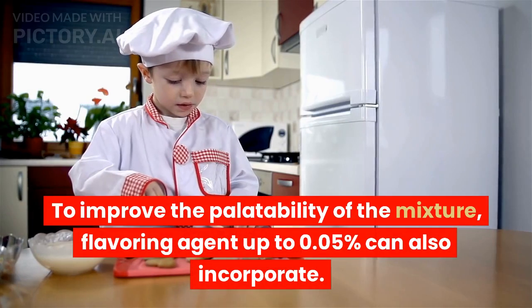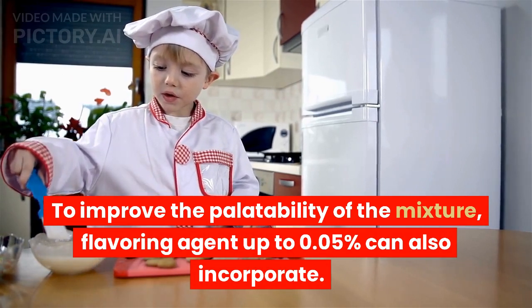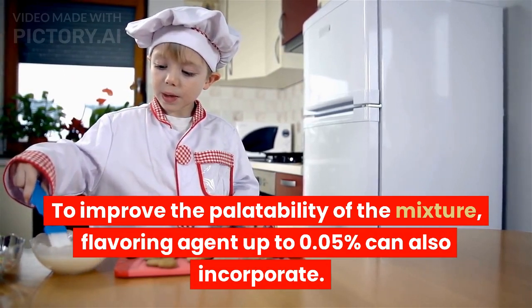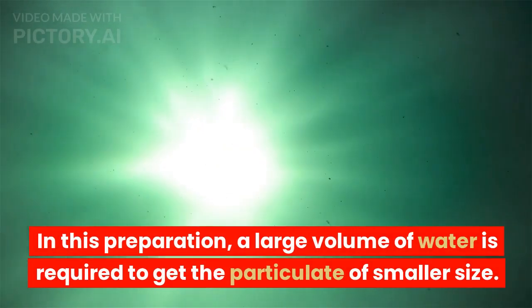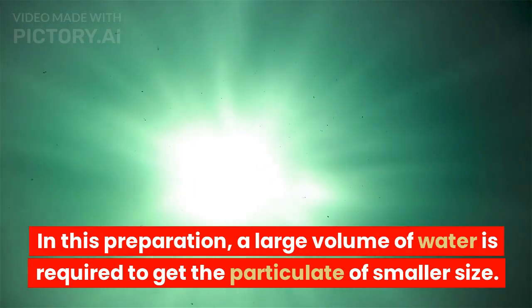To improve the palatability of the mixture, a flavoring agent up to 0.05% can also be incorporated. Chloroform is used as a preservative. In this preparation, a large volume of water is required to get particles of smaller size.